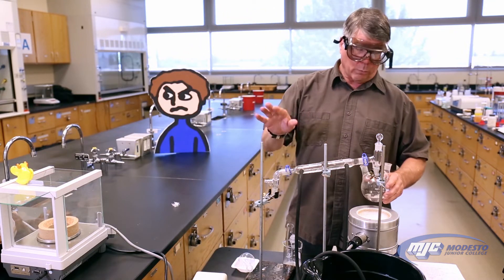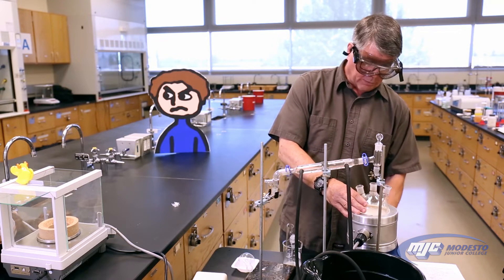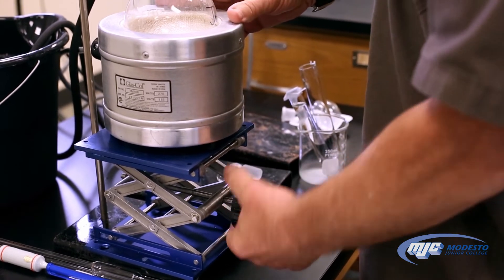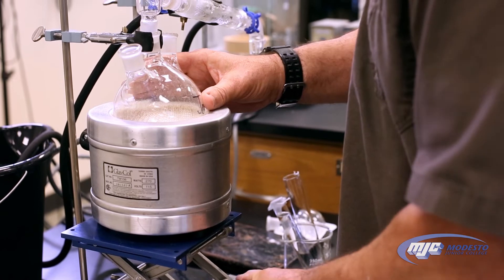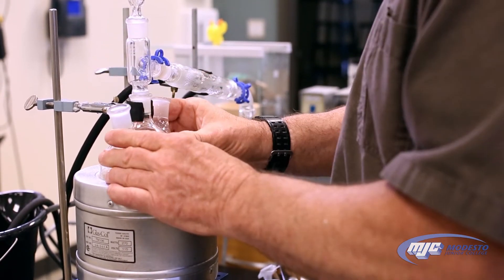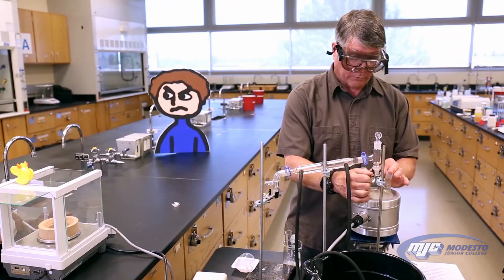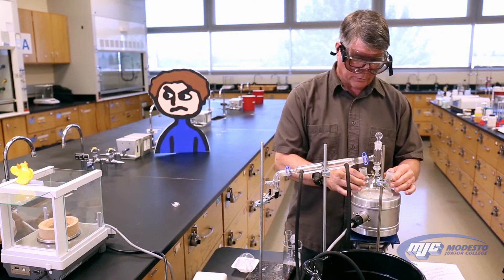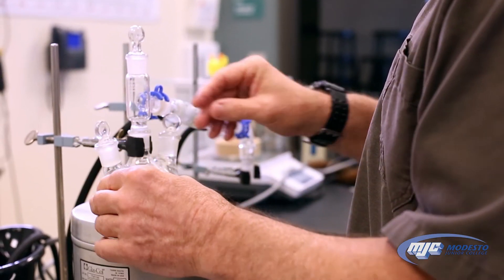Now I'm going to connect this up. This is a lab jack — it can raise or lower. This is a heating mantle; this is what's going to heat it up right here. And I want to attach the middle neck to our condenser. With this setup, we want to make real sure there aren't any leaks. Because if there are, vapor is going to escape and our mass of water won't be correct. We also want this to be tight. We have some glass stoppers that we're going to put into the other openings.